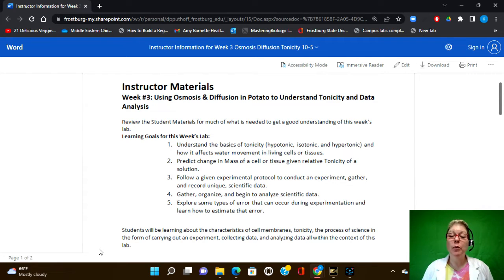Another thing they're going to be working on is following a protocol. Now, this is early in the semester usually. You really want to try to get them to read these protocols and understand these protocols and ask you questions about them before they dig in or as they're going. It can be very tempting to just tell them the answer to things, but I highly recommend that if they ask you a question that's in that lab protocol, don't belittle them, because a lot of students can have, I'll say, poor reading comprehension skills, or especially if they're nervous, they maybe can't understand it because of that. Just go over there and say, okay, let's look at the protocol together. And what that will do is train them to look at the protocol first, see if it's there. And hopefully by the end of the semester, they'll be really, really great at that. And that's one of our goals as well.